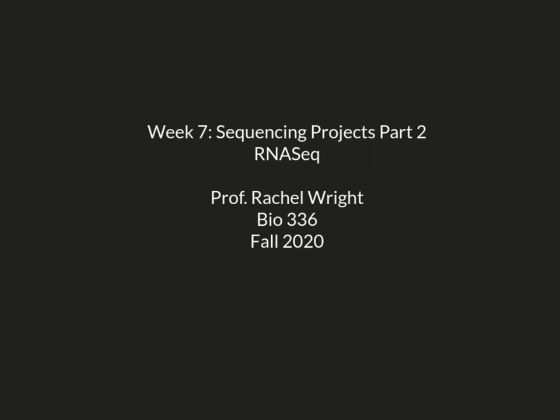Hello, today we are going to continue talking about different types of sequencing projects, and I'm going to specifically focus on RNA sequencing or RNA-seq in this video.